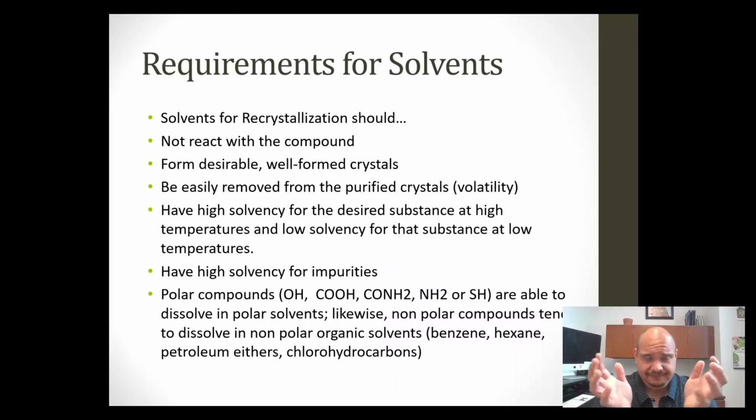At the very end, when you vacuum out all of the solvent from your solute, you're going to put a little bit of ice cold ethanol on top to wash away any of the impurities that might have been in the surrounding solution, and they're going to wash down into the filter flask. So you have to make sure that your solvent solubilizes the impurities at room temp, hot, and cold. Very important. The more of that impurity that's solubilized out of the crystal, the more pure the recrystallization experiment, the more pure the crystal is going to be at the very end.